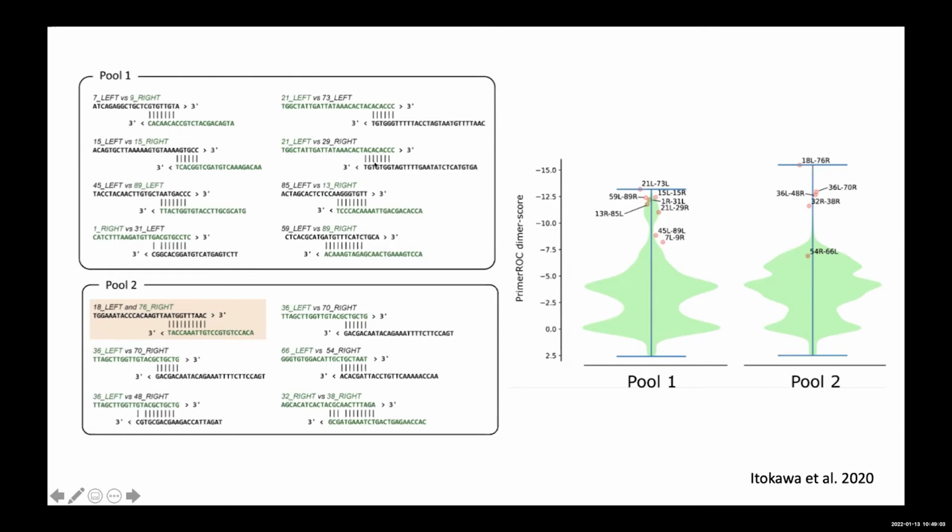If you look, all of these significant dimer products have a 3' anchored end, and if they're not, if you see this overhang here, the complement strand is 3' anchored. And initially we implemented a way to avoid these products, and we made version 4 primers. But then more recently, we've realized that exact matches aren't enough to prevent this phenomenon completely.